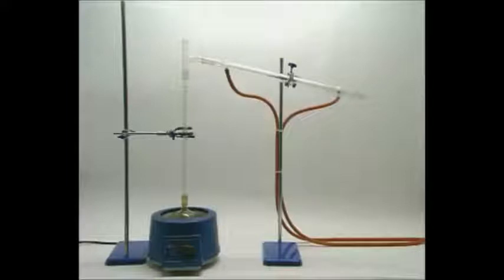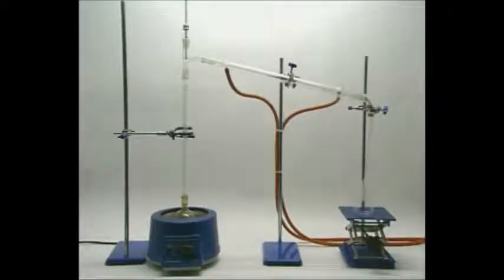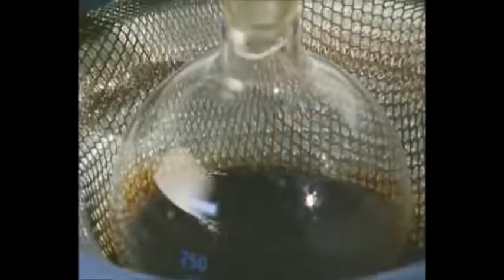On a larger scale, a fractionating column is used. The oil is heated with an electric heater for safety. The vapour is condensed by a Liebig condenser, and is collected in a conical flask. Hot vapour rises up the fractionating column.